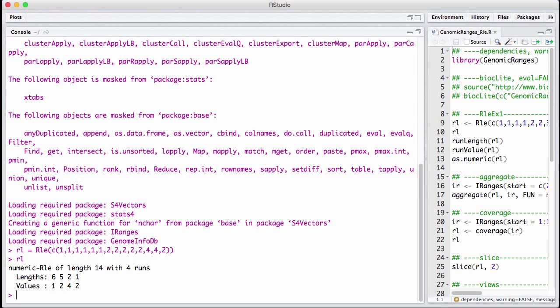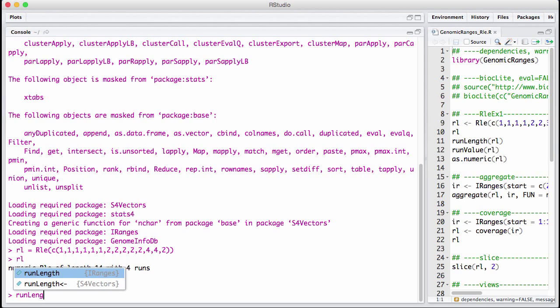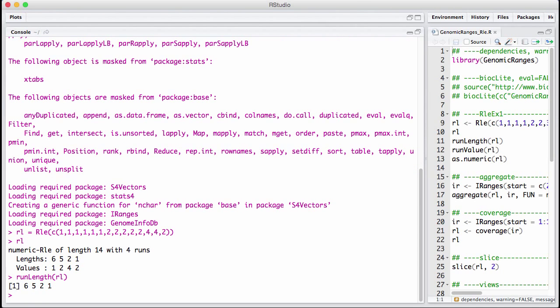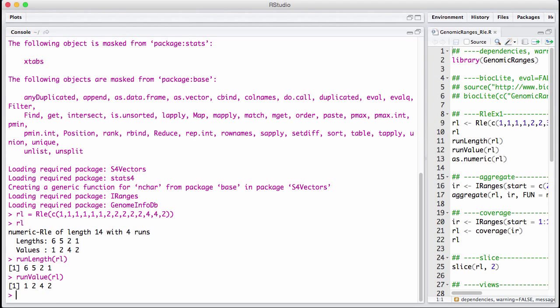So what it has done now is that it says this vector starts off with 6 with the value 1 and the value 1 is repeated 6 times. Then the value 2 is repeated 5 times, the value 4 is repeated 2 times and finally the value 2 is repeated 1. So here we can see we have something called lengths, we have something called values and we access them using runLength of rl and runValue of rl.